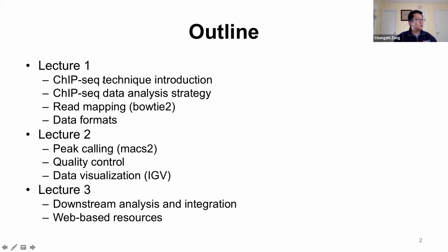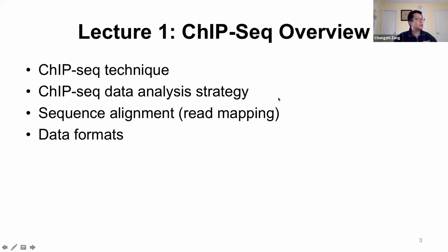So today, in this lecture, I'll be talking about the ChIP-seq overview with a few sections: the ChIP-seq technique and the ChIP-seq data analysis strategy. For the second half, we'll talk about sequence alignment, several things we want to pay attention to during the first steps of data analysis, and the data formats.